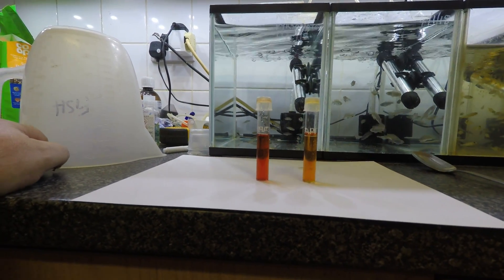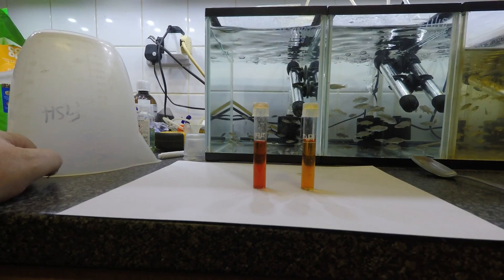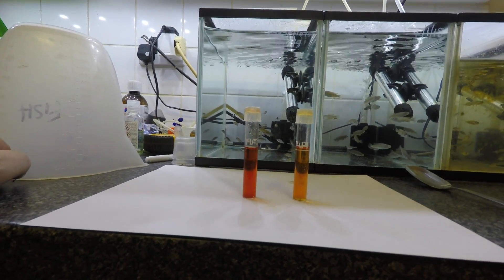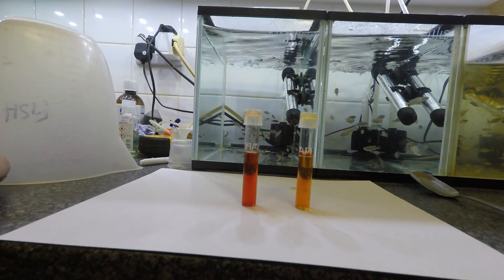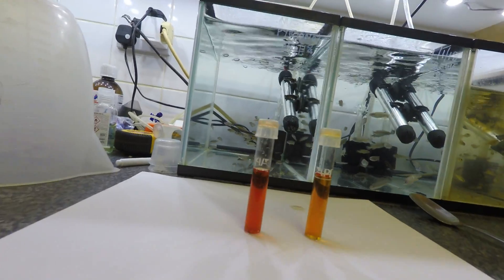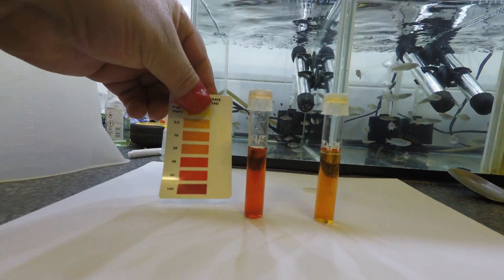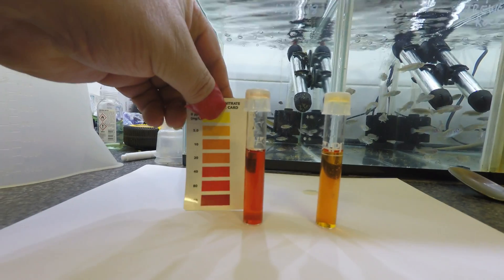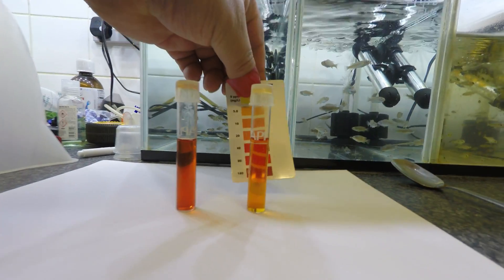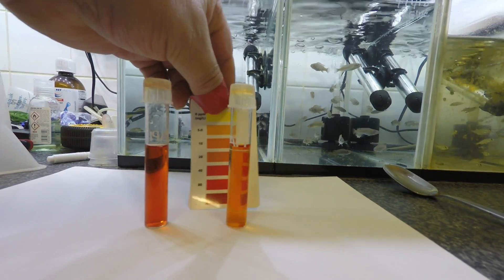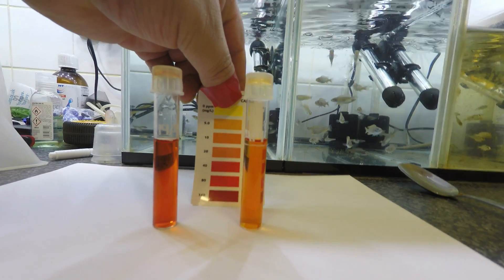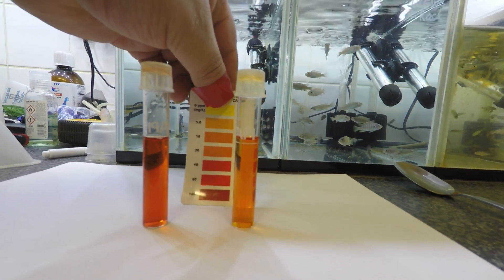It's been approximately five minutes since I filled the samples. The sample on the left, as you can see, is a clear red which is approximately 40. And on the right we've got a brown which is somewhere between 10 and 20.